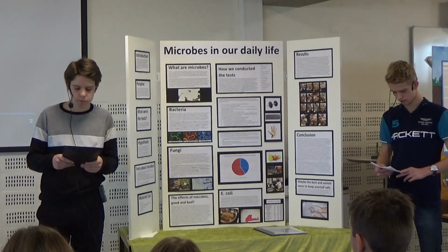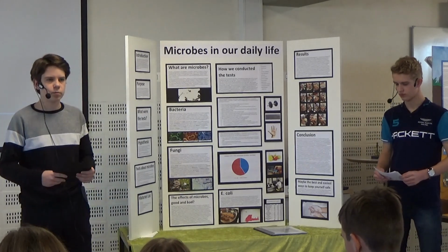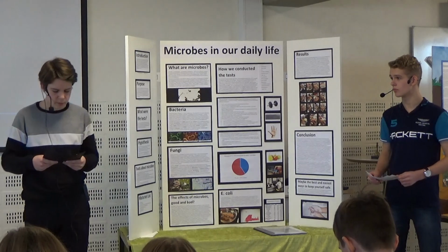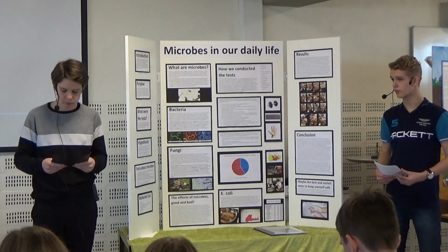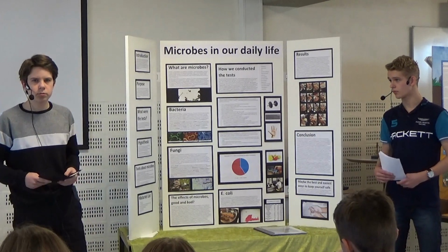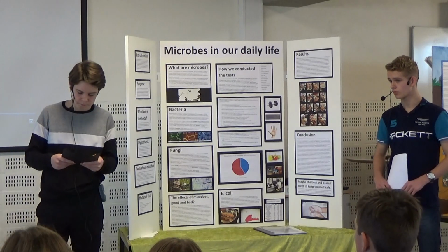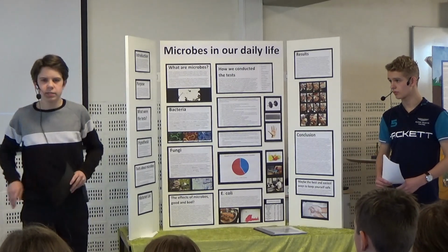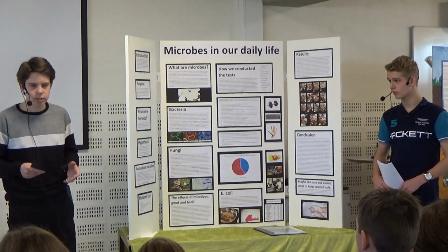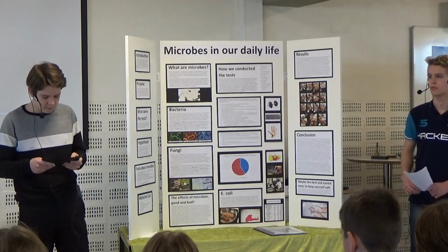The results showed that it was gram-negative, and we started thinking about whether it was E. coli or not. It had the smell of feces that we expected to have. The colonies looked like those pictures we found on the internet of E. coli. And it was gram-negative. From all those things they had in common, we concluded that it was E. coli.